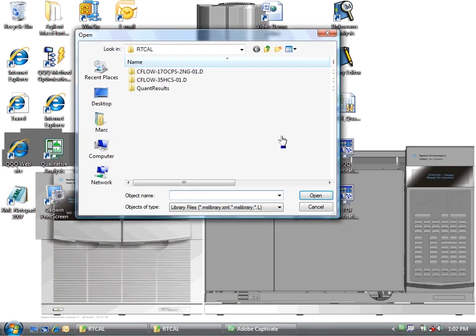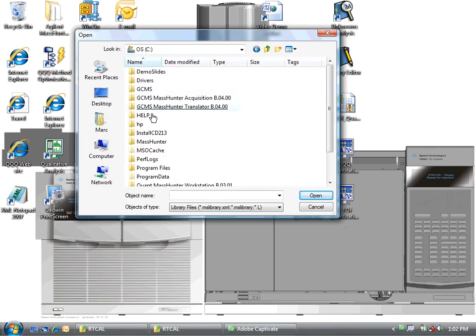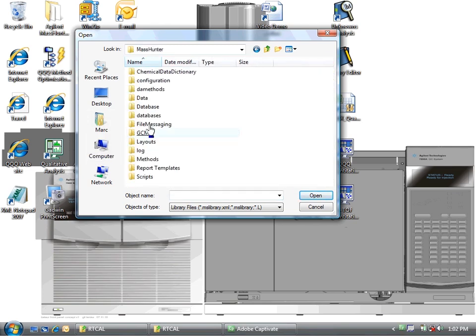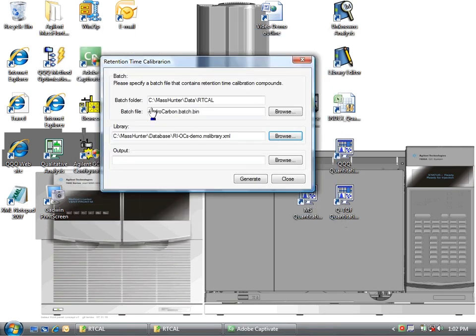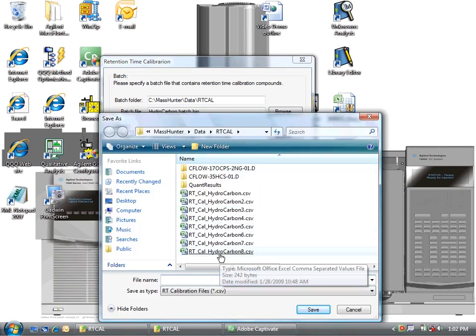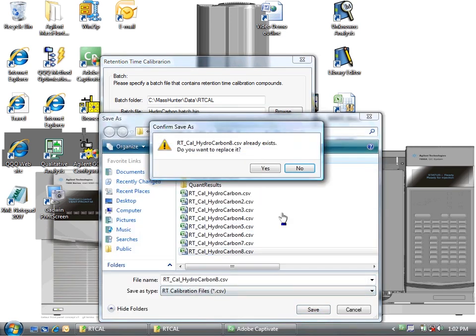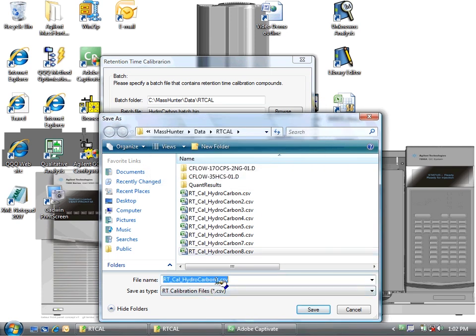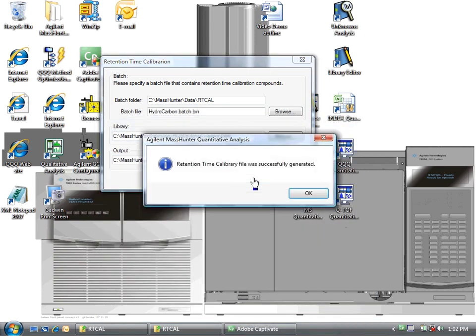Now the library that I'm using is the library that I've stored in MassHunter database, and I've called it RI. That is the library with all the compounds that I'm looking for in it. And last, I need to pick an output location. I will just call this, I'll label this number 9. So I will generate that file, and we'll take a look at it.